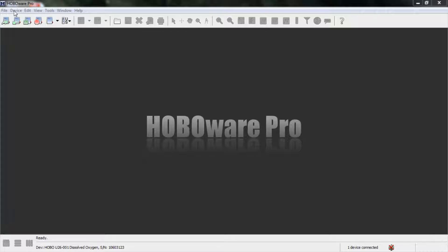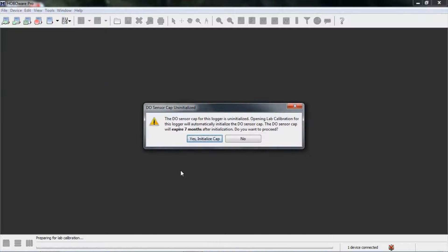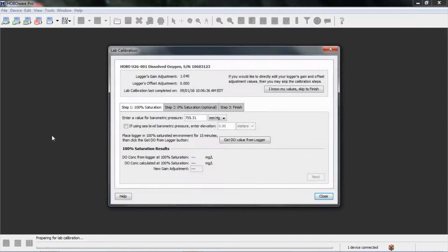Let's go into HoboWare and run through our calibration. We click on the device menu and access lab calibration. We get a warning message that the DO cap is uninitialized, which is correct — we just put it in. Opening the lab calibration and running through this will initialize the sensor cap and start the clock ticking. There are basically three steps: 100% saturation, 0% saturation, and then finish.